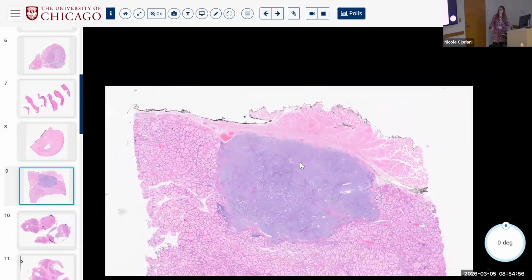Okay. So if you have skeletal muscle stuck to the specimen, and you don't see it up front, you will cut deeper to chase? No, I won't chase it if I don't see it. Because there are a few things that could happen. I make sure I submit all the muscle, but I won't do deepers. One is you could have overt invasion. Two is you could have a lot of desmoplasia at the edge of the tumor that just sticks the muscle to the gland, but doesn't actually invade.